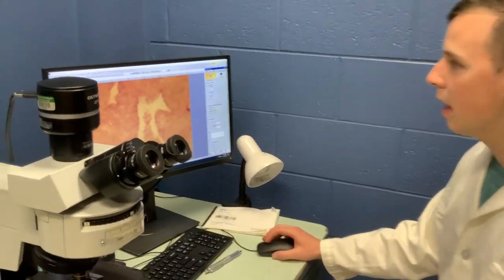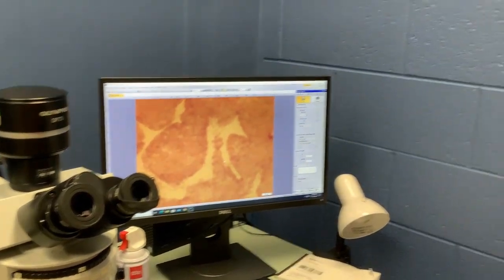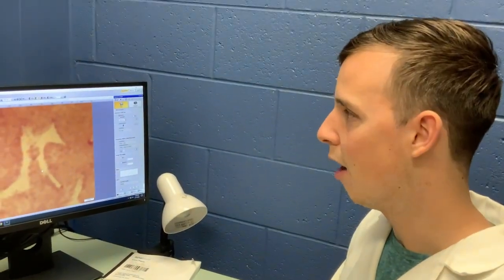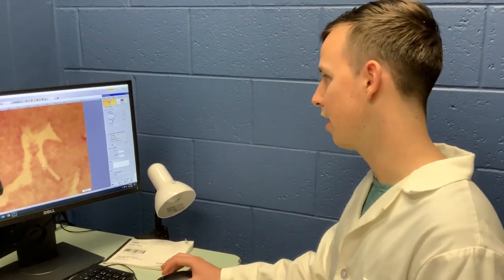So I've found my sample. When you log into the software, one thing you may notice is it may put up a popup about changing the layout to a simple layout — you can hit decline on that and keep the standard layout. Whenever you start a new account on this computer and log in for the first time, it's going to try to configure the software, but we just leave it at the standard configuration.